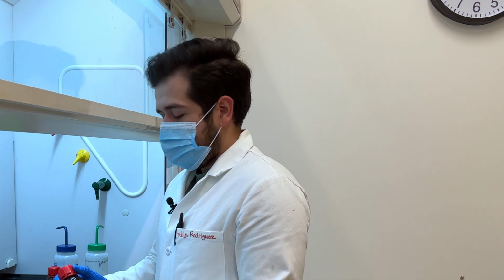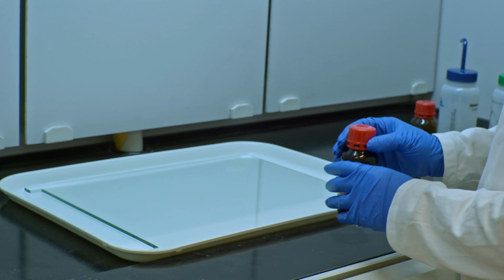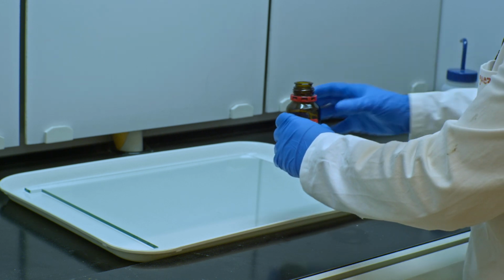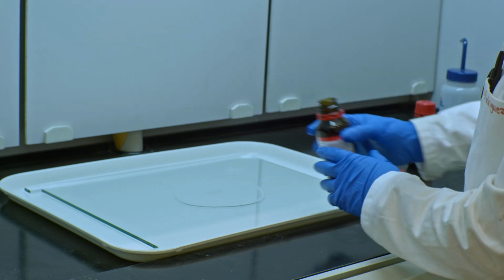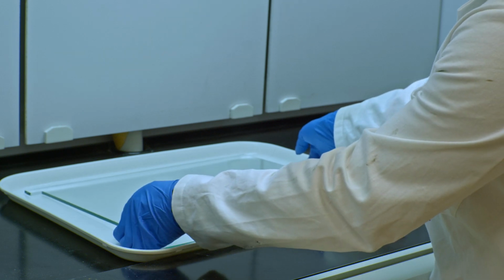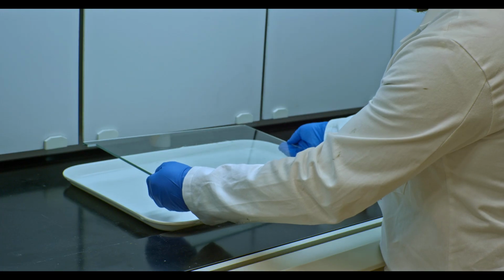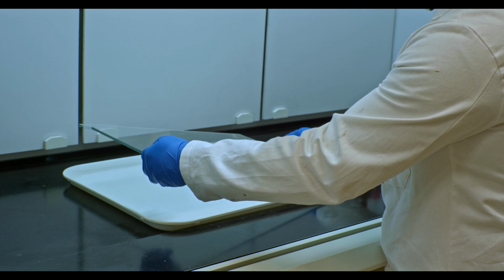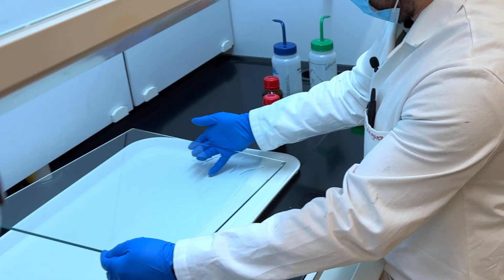The siliconizing reagent that I like to use is this Sigma coat that you can buy from Sigma Aldrich. And so what you do is you uncap it, and then ever so slowly pour it out into the middle of the glass plate. You only need a very tiny amount. And then pick it up a little bit and roll around the liquid on all sides. You are done once you have your siliconizing reagent in all parts of the plate, which will be important in preventing the sticking of the gel. This does take a little bit of practice to get done right.